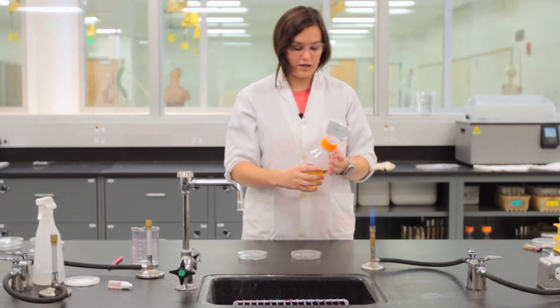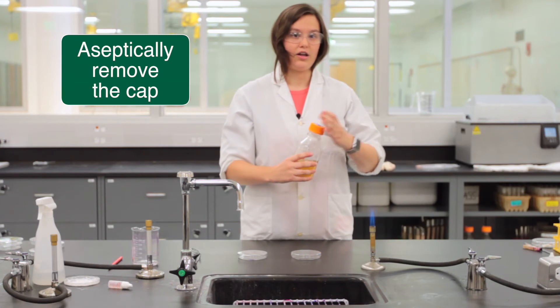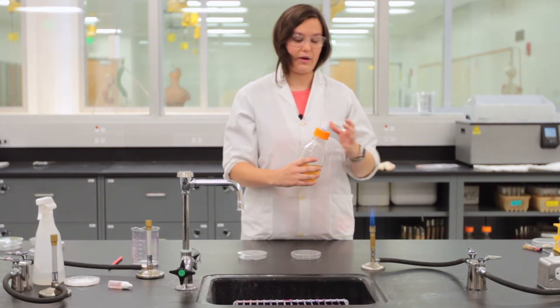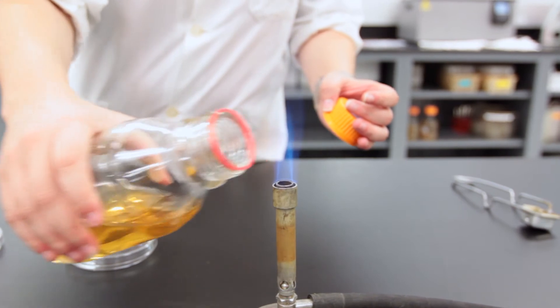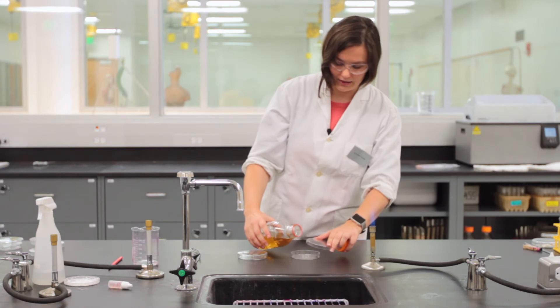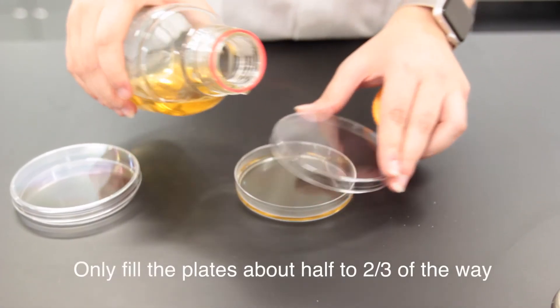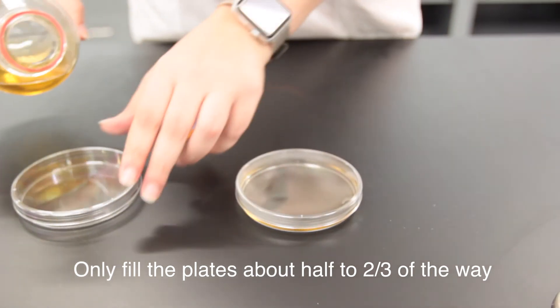Once the flame is going, you remove the top of the media bottle with your non-dominant hand — in this case my left hand — and pass the opening of the bottle through the hottest part of the flame twice. Then just barely open up the lid of the petri plate and pour in about half to two-thirds of the plate and disperse the media.